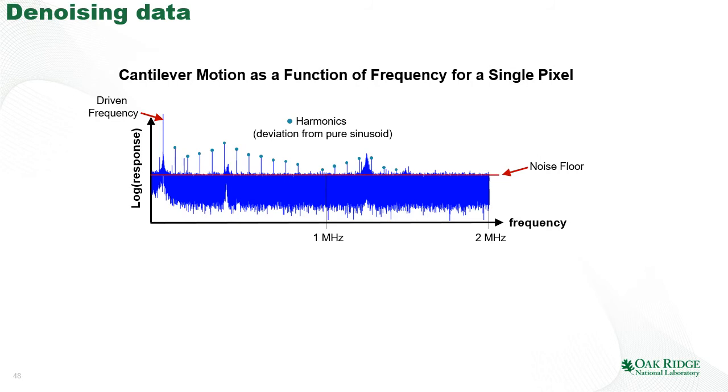In most measurements, this nonlinearity is very weak, and practically we can say that it is irrelevant. But if we can measure it, then we can already work with it. And also you can see here the peaks corresponding to the first, second, and third eigenmode of the cantilever. These peaks are due to the thermal excitation. So the thermal noise will excite the cantilever, and this excitation depends on how close we are to the resonance.